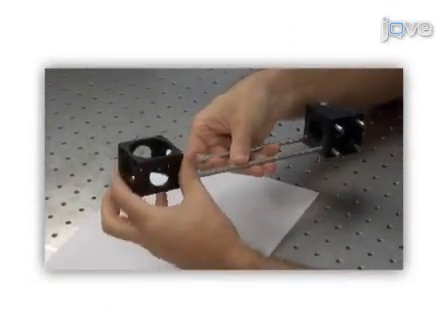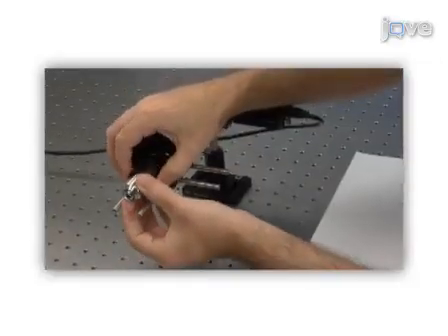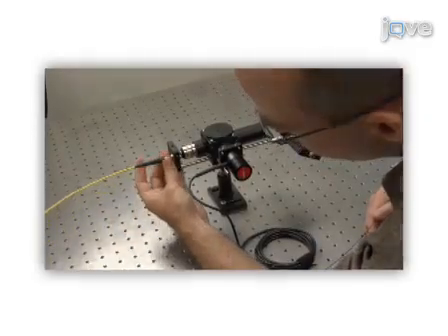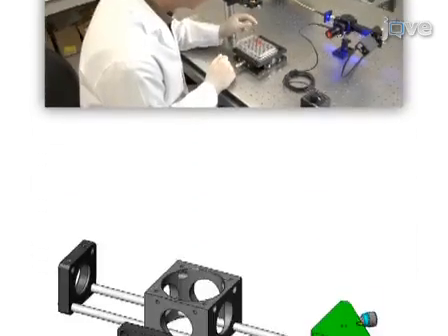Here, we demonstrate how to build a high-resolution fiber-optic microendoscope system in a single day, using off-the-shelf components for under $5,000. The platform offers flexibility in terms of image resolution, field of view, and operating wavelength.